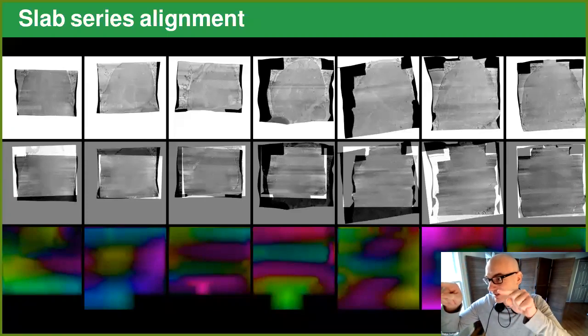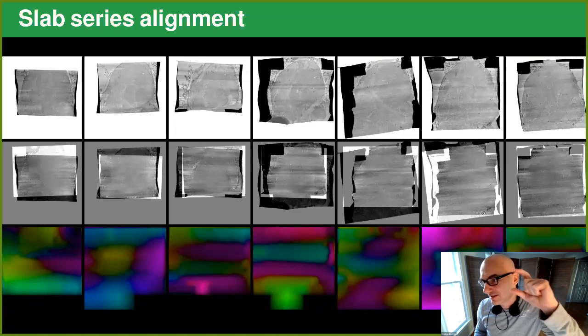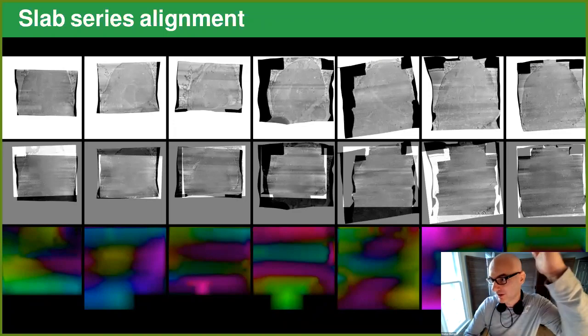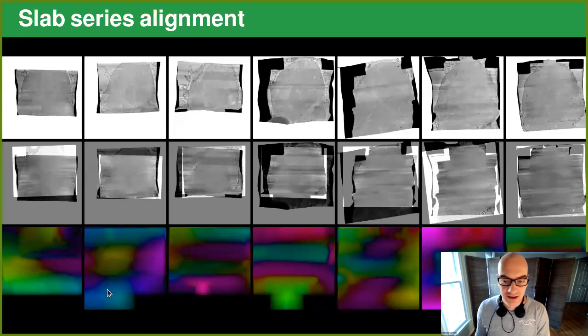And then for large block sizes, they converge to the average affine model, so they drift off, right? And what we're interested in is this stable region. You can find this by just looking at the entire scale space. We're basically doing this for every pixel. We don't start at full resolution. So we first work with downsampled versions of the images, but eventually we do this at the full resolution of the entire data set.